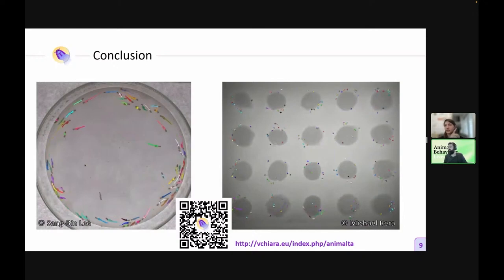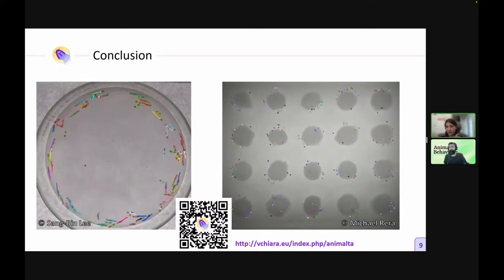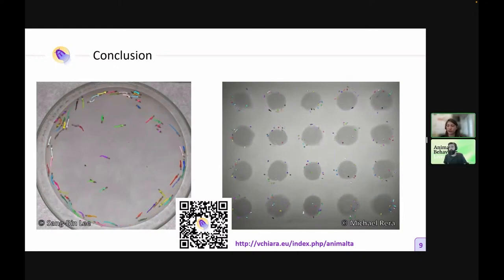Okay, great to know. This will be for the next update. For the moment, it's not like this, but it will be the case for the next update.